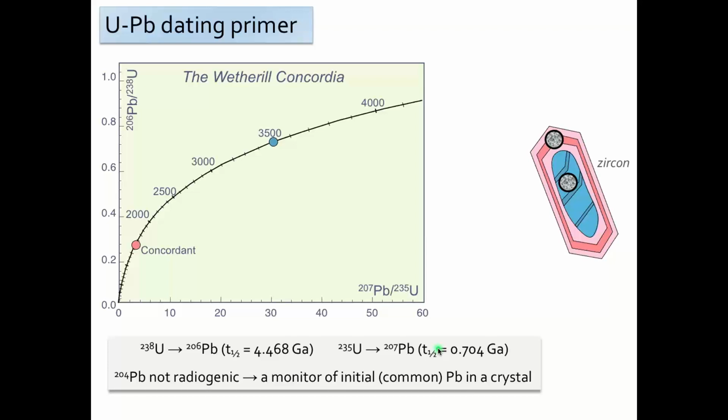And then let's imagine now that we had an imperfectly placed analysis, and it might mainly be, for example, core with a small bit of rim, but it's going to be a mixture between these two components. And similarly, if we've got a rim analysis with a small bit of core, it's going to plot closer to the 1.5 billion year old rim. So these analyses are making a mixing line, which is called a discordia, between these two age components. Because we've got two decay systems, we can see, for example, the systematics of how the zircon is behaving. We can also have discordias for other reasons.